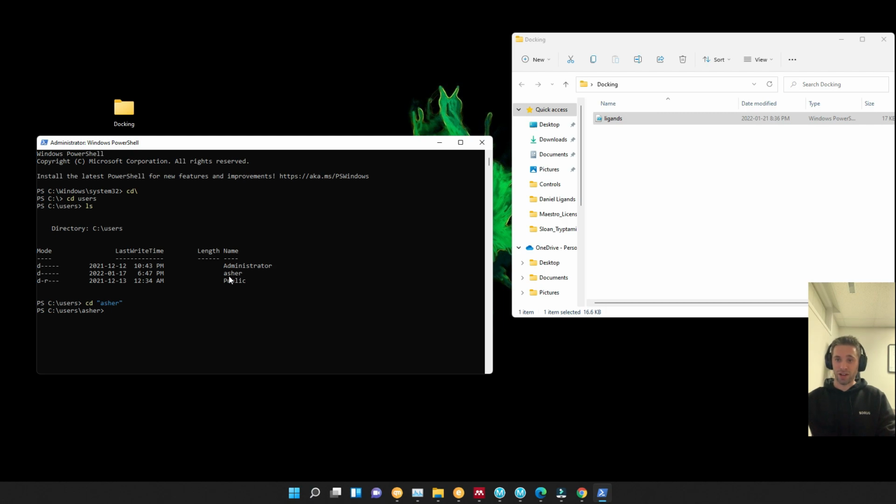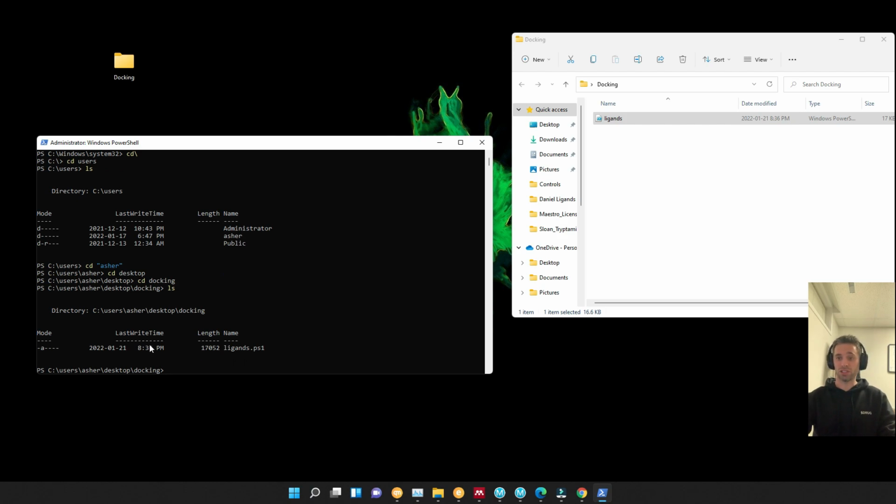We're now in this folder called Asher. We want to go to the desktop, which is where this is. So we'll go cd desktop. We're now in the desktop. We want to go to the docking folder, so we'll go cd docking. We're now in the docking folder. We can now list the files to view them, and this is the file that we want, which is right here, and it's the same as this file over here.